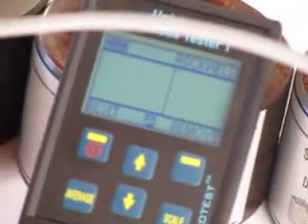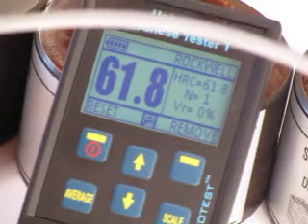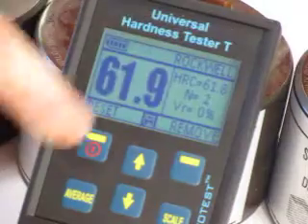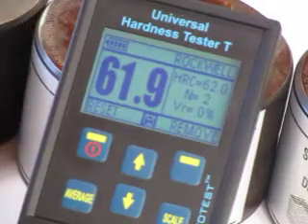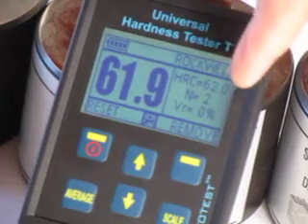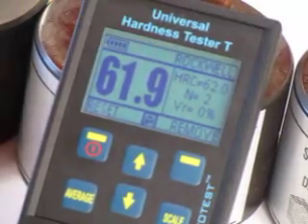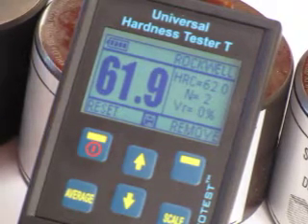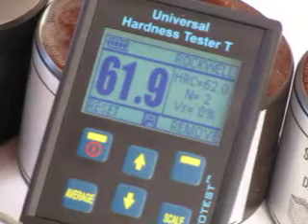Normally you're going to be doing more than one test, so I come back to the material again, push down, and get another hardness test. You can see we're extremely accurate — it's repeating and giving us a variation below 1%, with an average of 62 on the Rockwell scale.